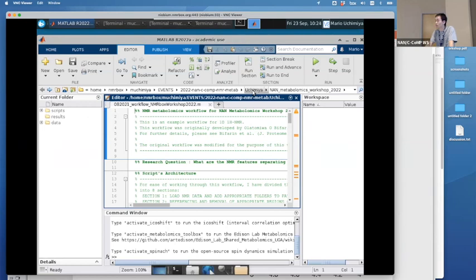If they're just totally different things and there are no overlapping variables or functions or definitions or things like that, you're probably totally fine. Especially on NMRbox where they have tons of memory. But if you're working, for example, on a different function in our toolbox, that's probably going to end up conflicting with what you've got here.